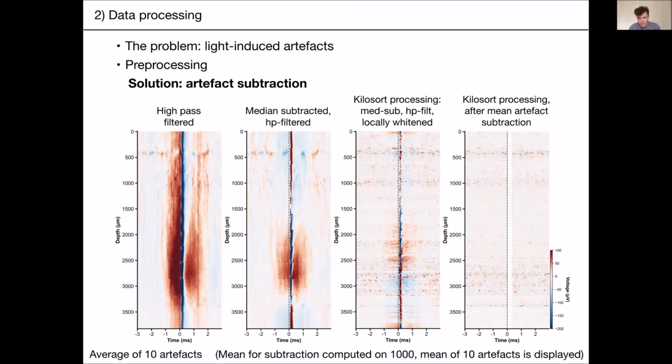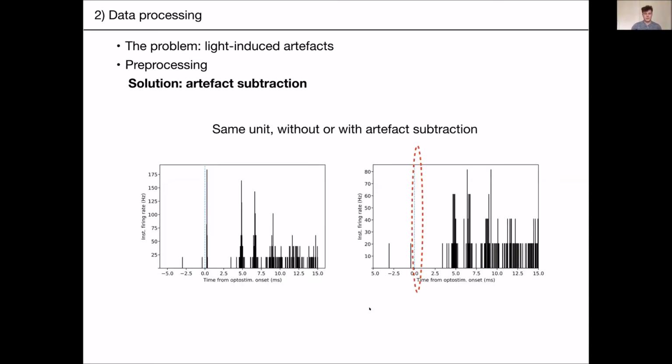So you can simply blank it like that. These are 300 microseconds, and it's fine to trash 300 microseconds of data overall. You can replace these by interpolating values between 0 and 300 microseconds, and most of your problems will be gone. If you do that, this is what happens. So this is the false positive example I showed you before. I found that, respike sorted it after removing the artifact, and the artifact was gone.